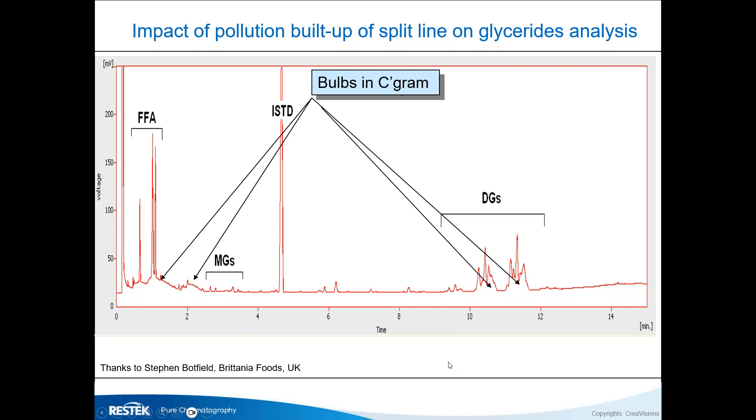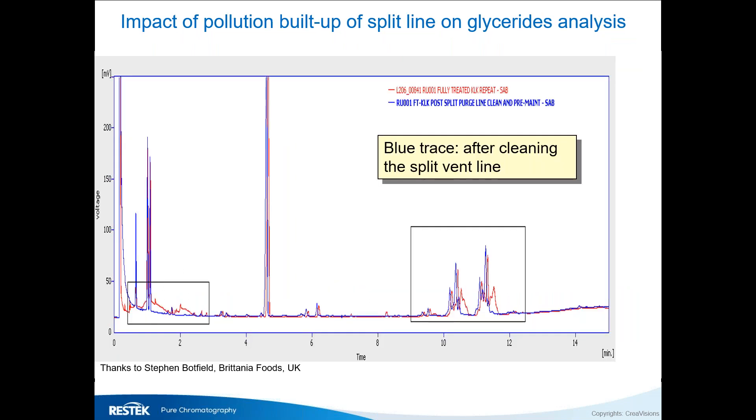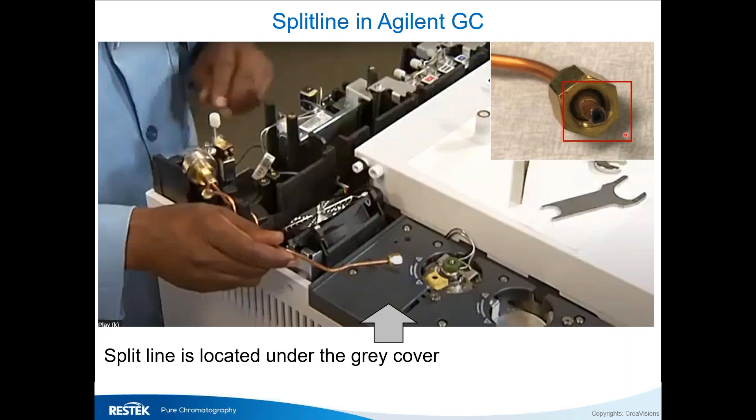A food lab sent me a chromatogram asking about broad peaks. Broad peaks in a chromatogram mean something is introduced in a very bad way. When I asked when they had last checked their split line, they hadn't. After cleaning out the whole line, the chromatogram looked exactly as it should. That's a typical learning curve — the split line is quite important and you need to make sure there are no deposits in it.